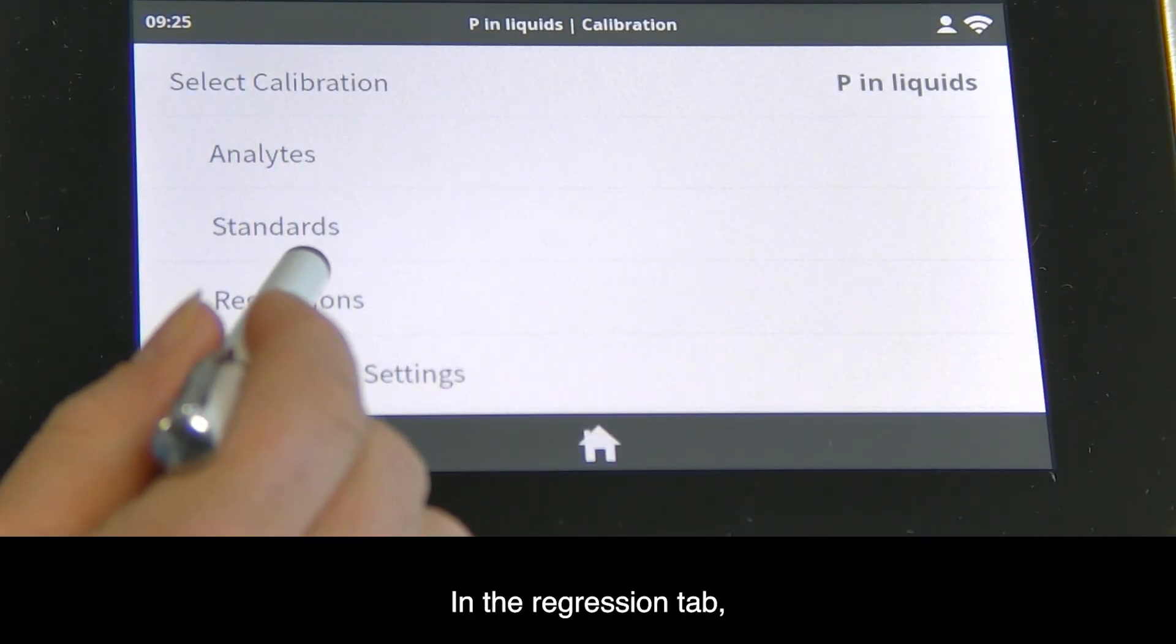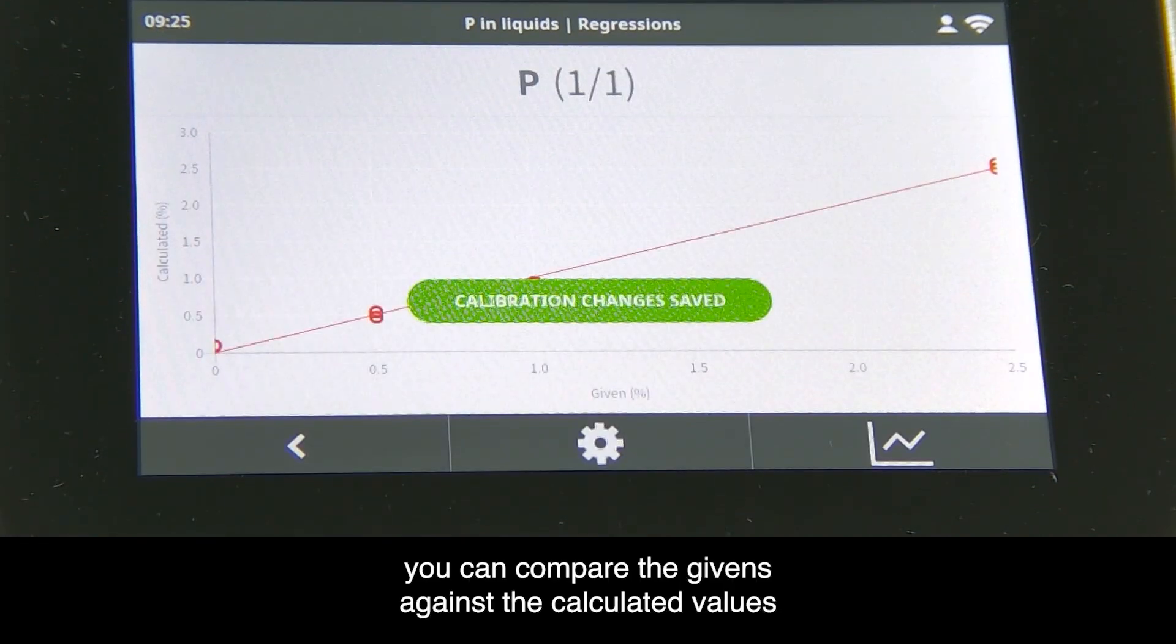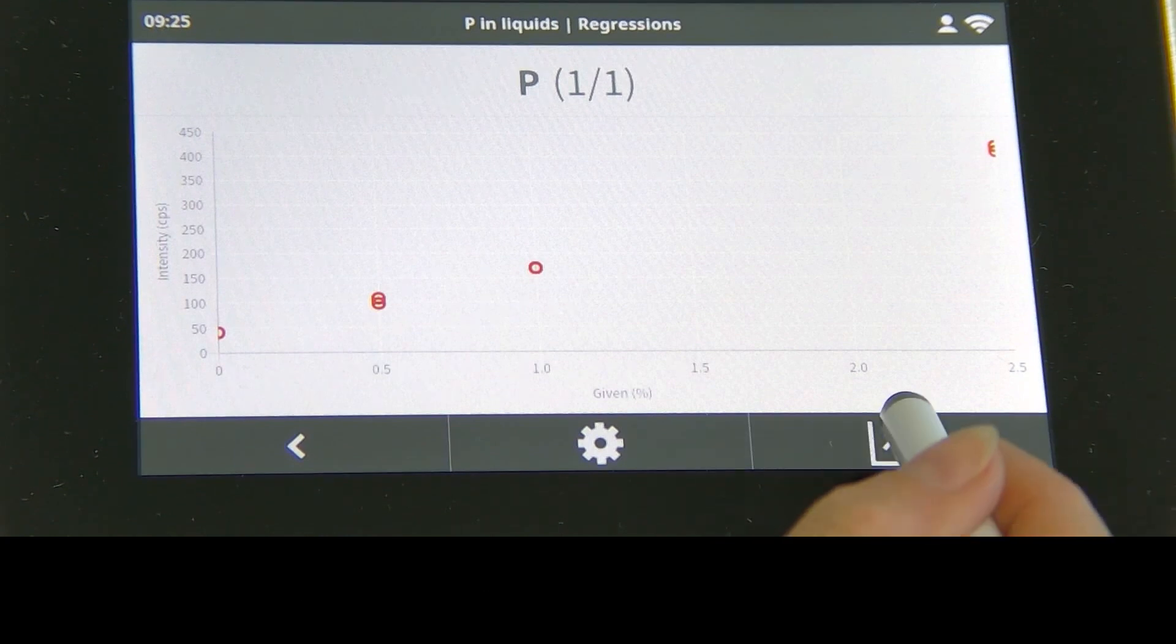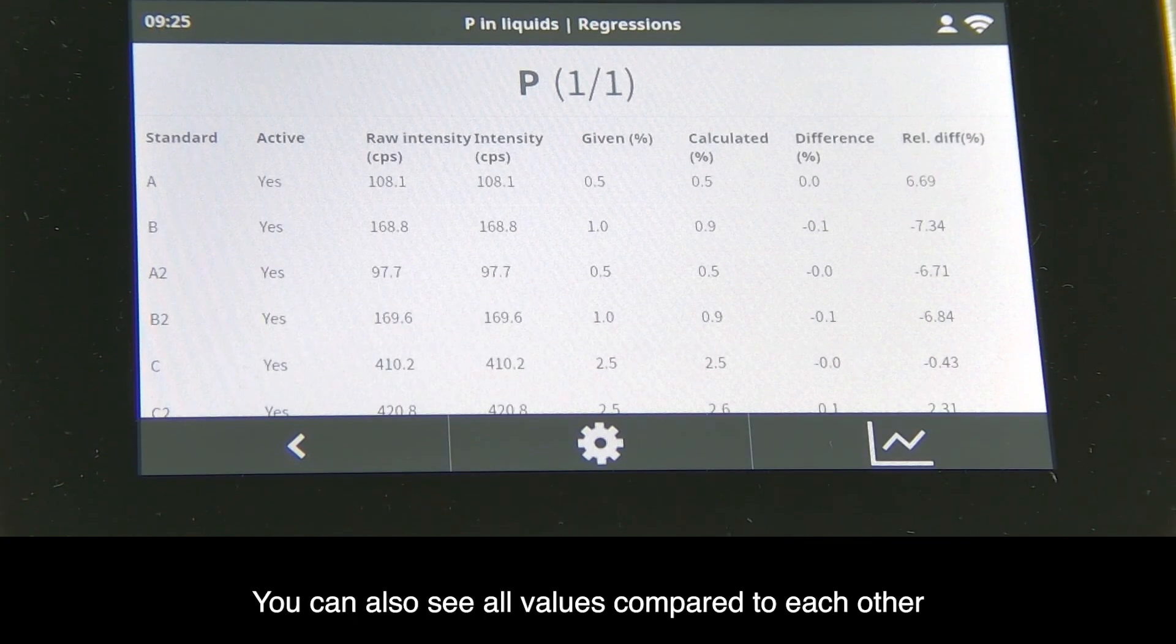In the regression tab you can compare the givens against the calculated values or the givens against the intensities for your phosphorus. You can also see all values compared to each other.